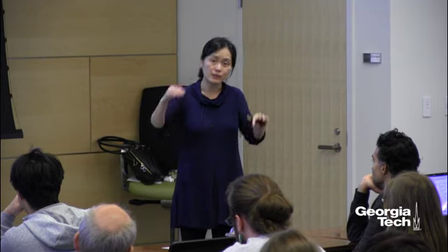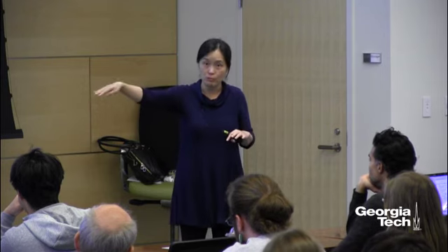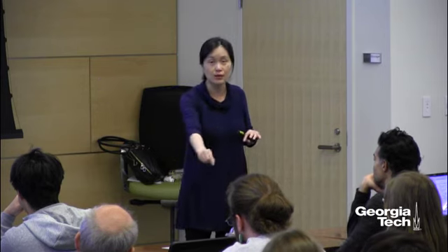What Stefan Hell's group showed is that if you wait, instead of exciting again a few nanoseconds later, until the molecule goes back down from the triplet state to the ground state, then the molecule doesn't bleach as quickly. Because when they are in the triplet state, they are very susceptible to oxidation, because oxygen is in a triplet state. So with what they call dark state relaxation, we're actually increasing the total number of photons you are getting. And that's what we're seeing here as well: they just don't bleach as quickly.